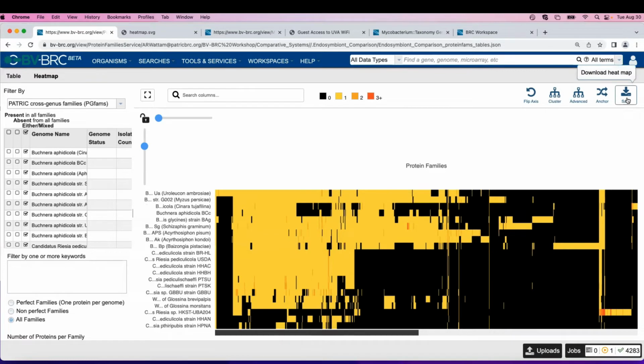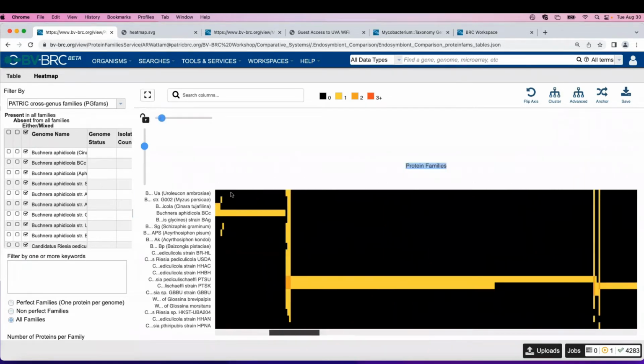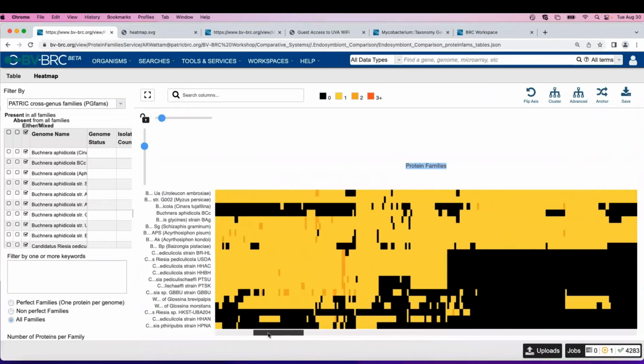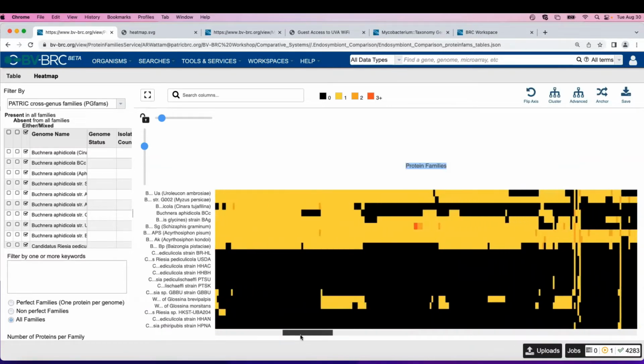When I get the picture that I want, I can save it, and it doesn't have to be all of this. It can be just a subsection of it. Like, let's say, come here, you. Let's say this is my favorite section, and I could even stretch it out more. Oof, if I wanted to. Sometimes you have to have a bit of finesse while you're messing with this thing. Now this would be my favorite part. So I could say, this is the one I want. It's perfect. That's what I want in my publication. I don't want the whole thing. So I click this and just say, save the snapshot.